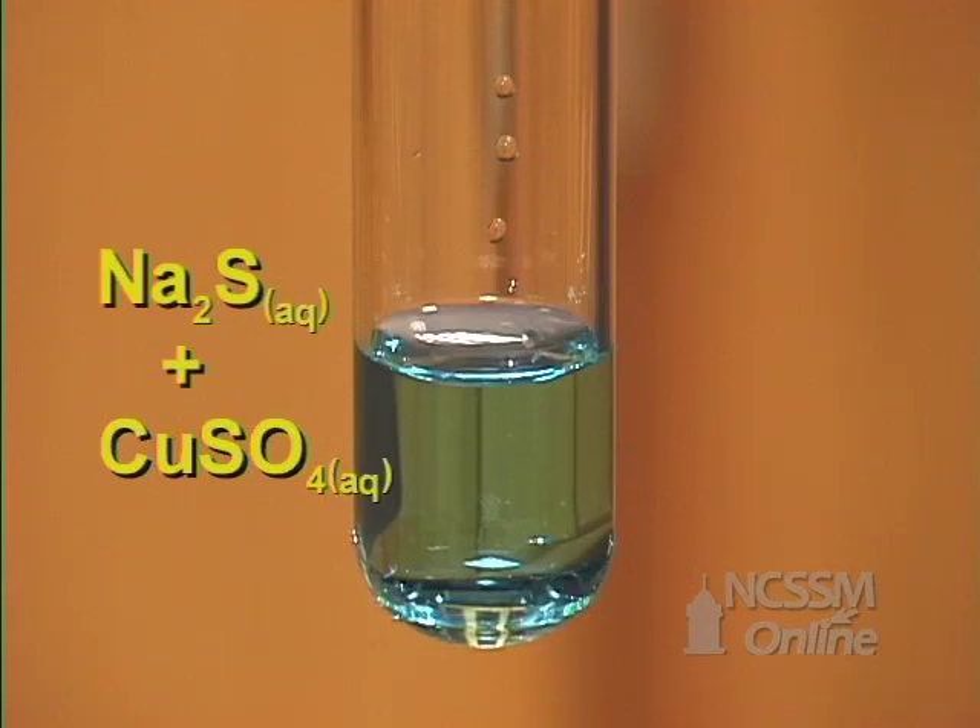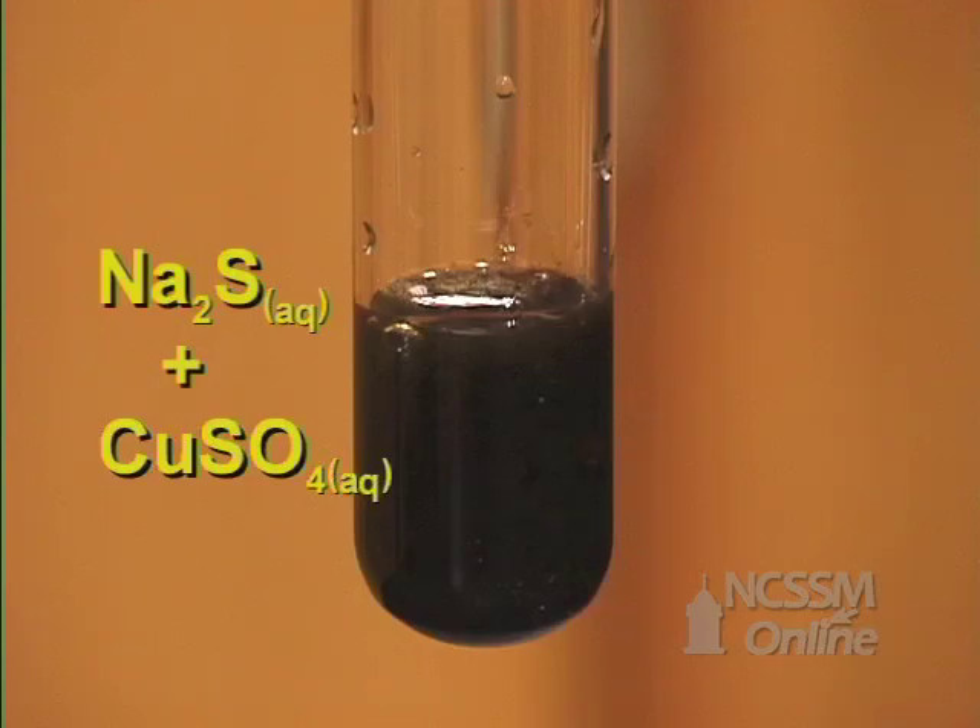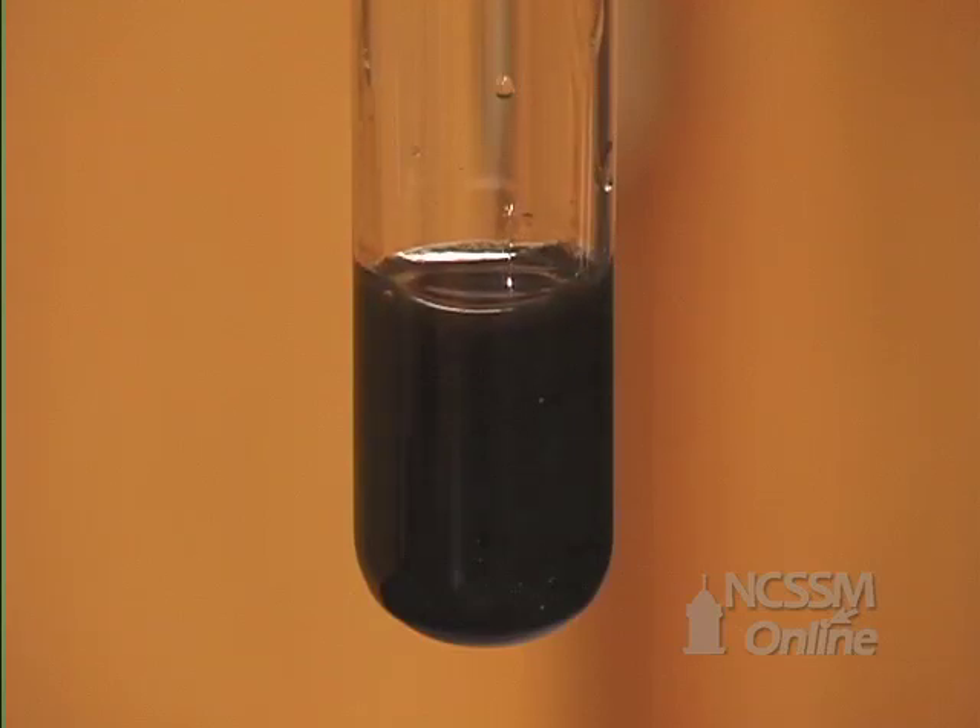When the sodium sulfide is added to the copper sulfate, we get the rapid formation of a brown-black solid. The brown-black solid is copper sulfide.